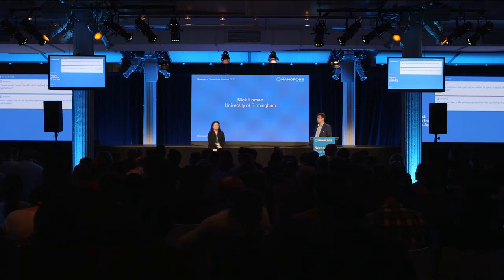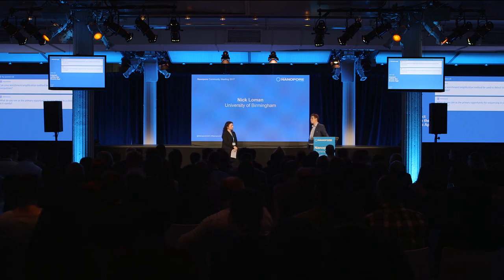How important is the accuracy of the reads over the length, for clinical settings? I guess you mean read level accuracy. What's more important, getting long reads or getting accurate reads? I think it depends a lot on what you're trying to do. So there's a few different points here. If you want to track plasmids around a hospital, I think you need the long reads. To put a plasmid together and actually type it and understand what genes are in the plasmid versus what are in the host and what are in both, you need the long reads to be able to do that kind of work.